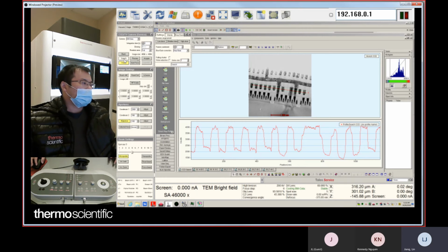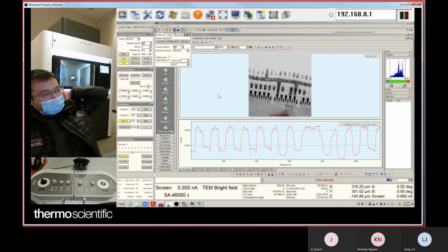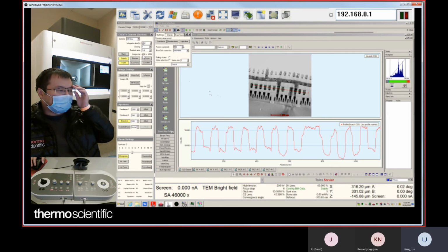In this way, you can get 16,000 counts as well. In this way, the max counts tend to be 32,000 as well. You see, you get 16,000 counts. But let's say, because you have 4 frames, you divide by 4. Right now the count for each frame is about 4,000, so it's below 8,000. So it's good.